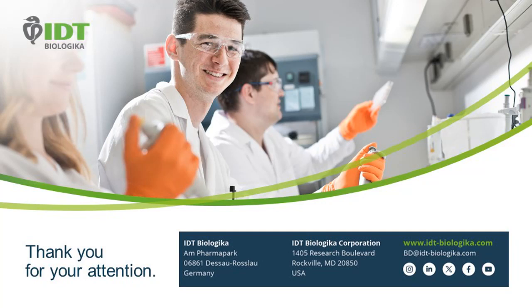Typically the first step is to set up a small-scale model and to confirm the data from the current process from our clients, and starting with these small-scale models, to investigate further adjustments. After finalizing these development activities, we start with the receiving manufacturing site, then the tech transfer.